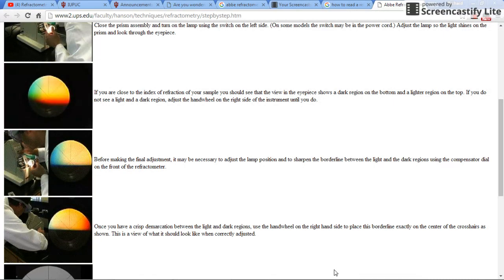In this case, what we're looking for is, does it have an octane rating of above 87? If it has an octane rating of above 87, then it could be, but probably wouldn't still be in the amounts that they listed on the label, be a, quote, engine improvement.